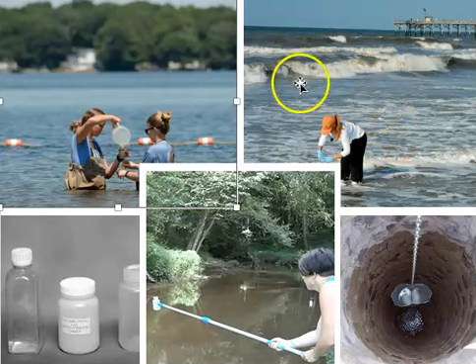Same thing is going on over here on the right. This person is collecting water, not from a freshwater region, but from a saltwater region. Again, probably a beach where people are allowed to swim. It's a little bit trickier when you're checking saltwater areas because, of course, you have to deal with the tide. But again, you'd want a series of samples specifically from the areas where most people are using the water. And at most beaches, that's right up near the shore.